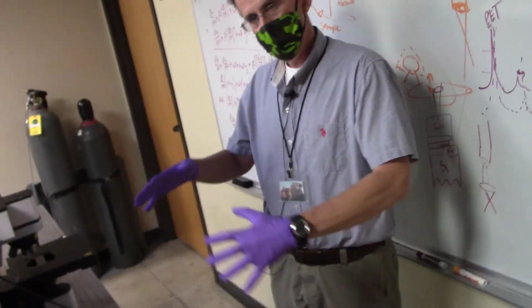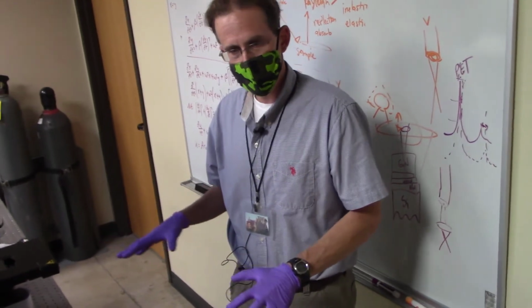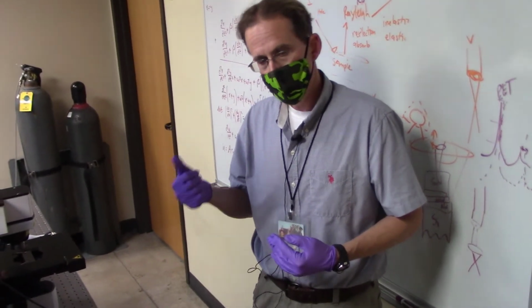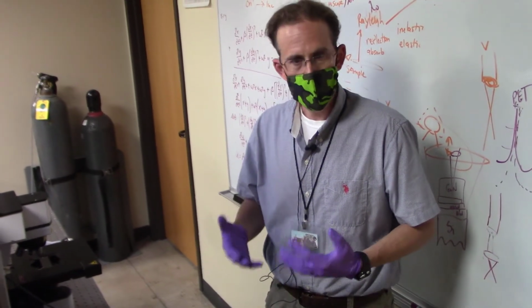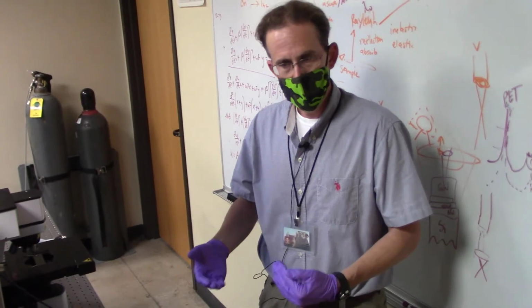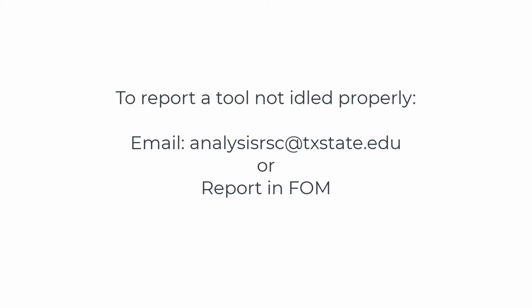So what we ask is that if you find the tool in a state where you can't verify that these things are as I've mentioned they should be, please inform SRO staff either via email or via FOM. You need to let us know that the previous user didn't idle the tool properly, so we can go correct that action.